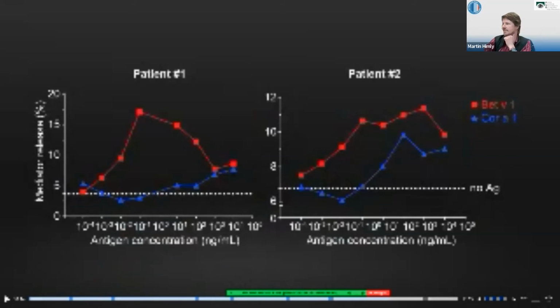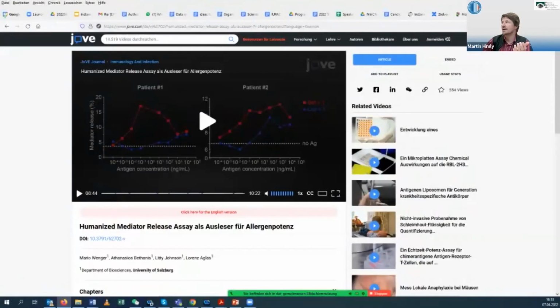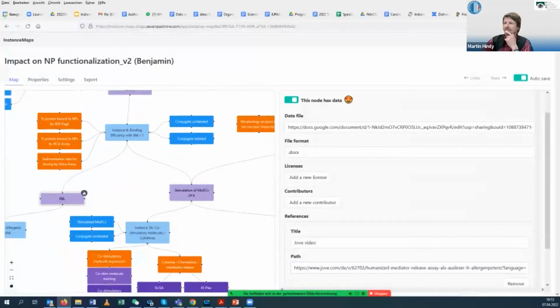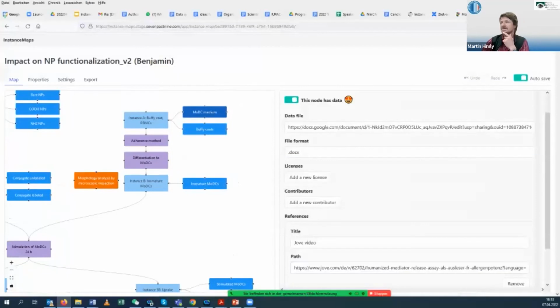So I guess with this, I stop showing you the evaluation. But these are certain aspects that need to be taken into account. This concerns this RBL assay, and as we have seen in this evaluation, some viability assessment was required. We know that other biological assays, like the monocyte-derived dendritic cell assays that I guess Ben will say a few words on next, definitely have a similar issue.